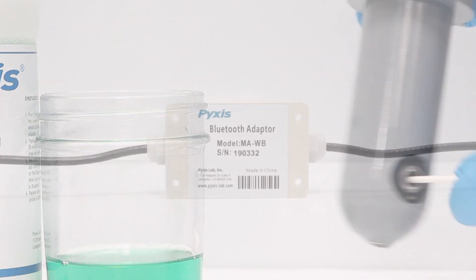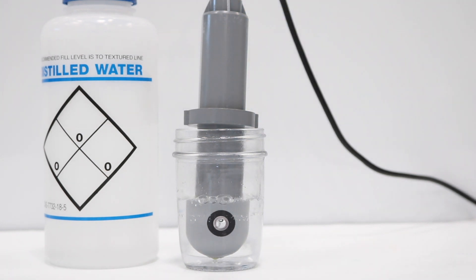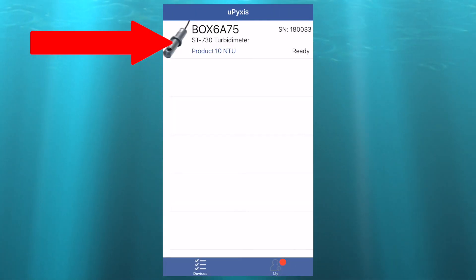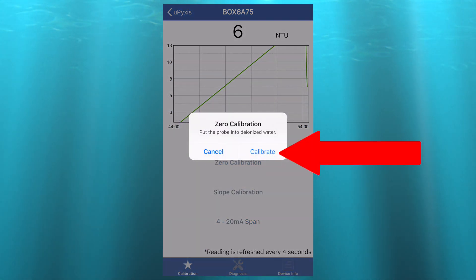To monitor your ST730 using the uPixis app, you will need the Pixis Wi-Fi Bluetooth Adapter to be connected. To begin the calibrating process, place the probe into DI Water. Then on the uPixis app, select the ST730, then select Zero Calibration and Calibrate.